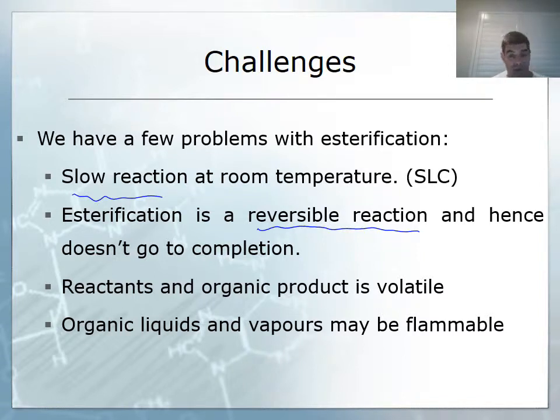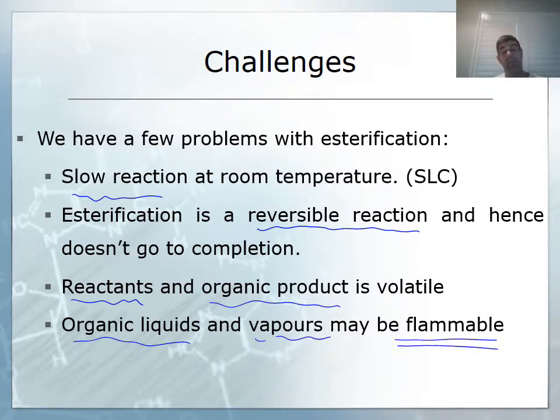We also have a problem with the fact that both the reactants and the organic products are volatile. They quickly move from the liquid into the gas phase, and you'll know that because you could smell them in the lab. And finally, most of the liquids, not so much the acid, but certainly the alcohol and the ester, both the liquids and the vapors may be flammable. And therefore, we have an issue with naked flames.